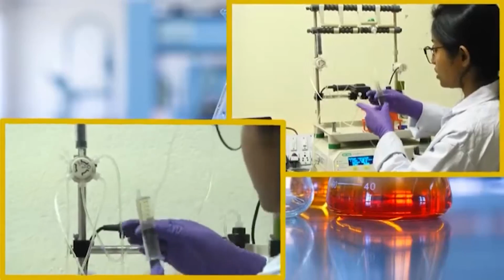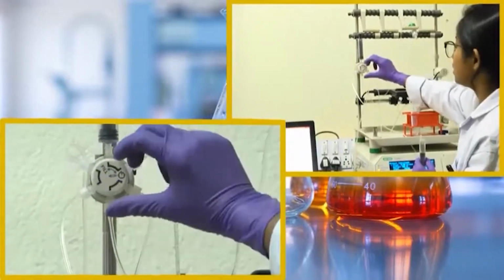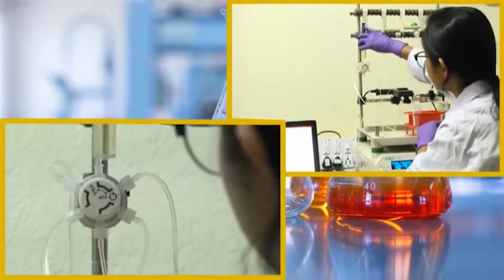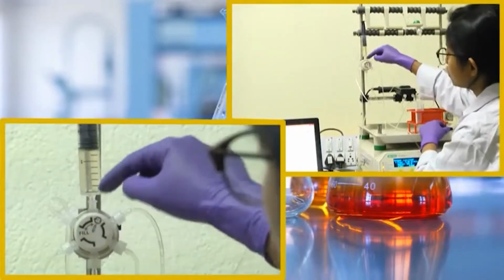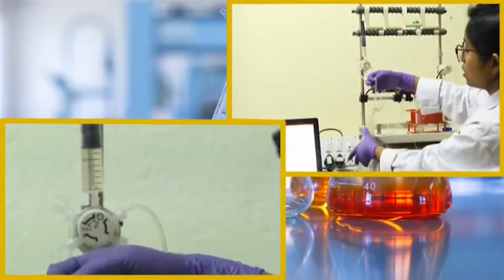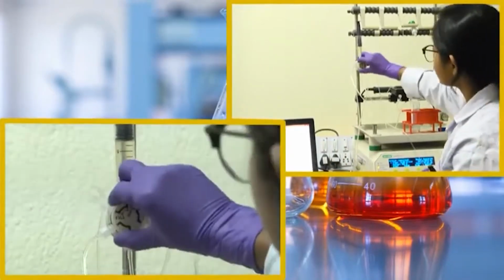Now, our solution is in that particular syringe, and as you can see, there is a marking and a two-sided arrow here. Before you start loading your sample, I will remove this empty syringe, put the syringe which contains my sample, and then twist this side. This means I can load now. This will ensure that my sample is inside the sample tube. This sample tube has a volume of 10 ml, so at a go I can load 10 ml of sample.